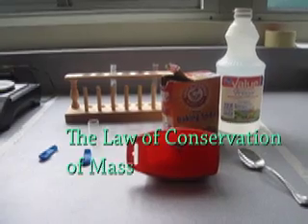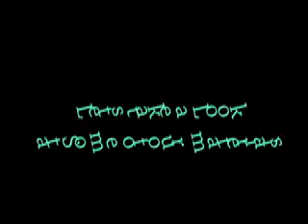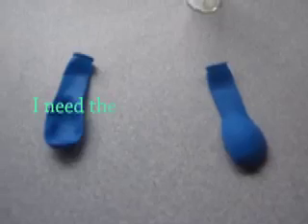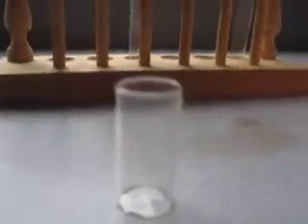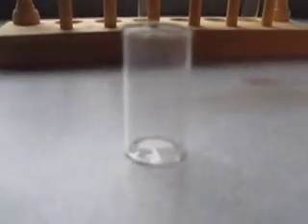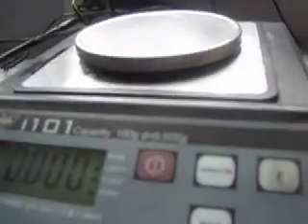In this demonstration for the law of conservation of mass, I need the following things. I need two balloons. I need this fancy little thing that I call a test tube holder so it doesn't fall over when we weigh the test tube on the scale, which you will see in just a minute.